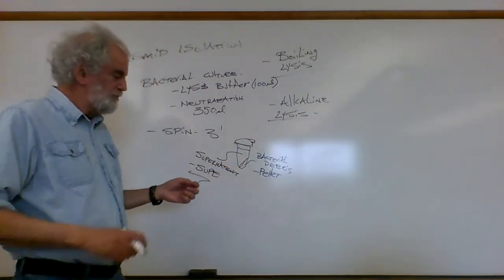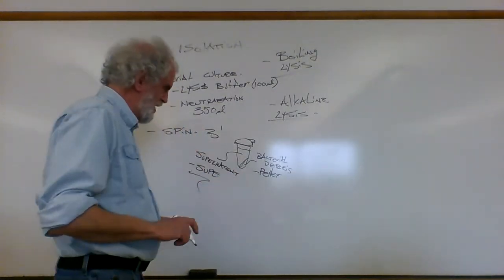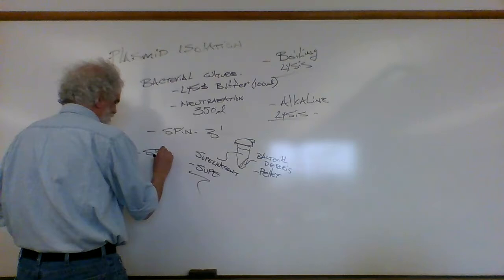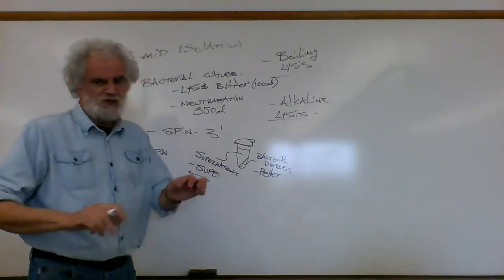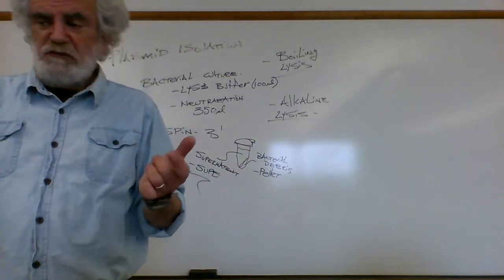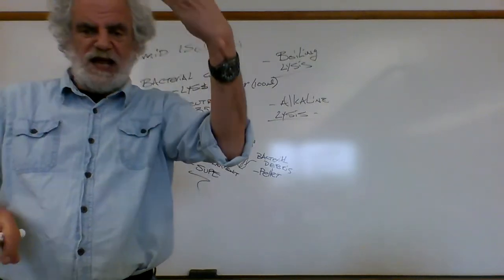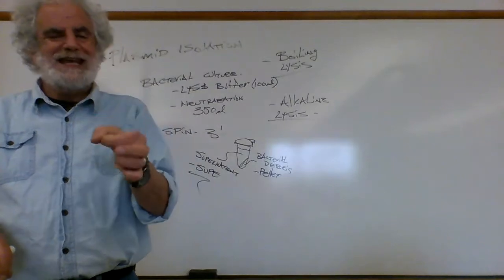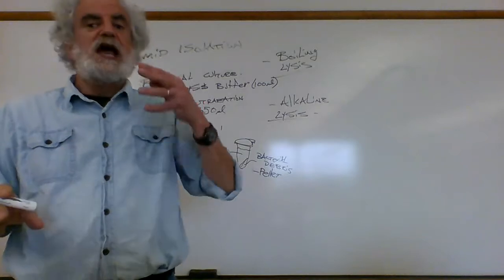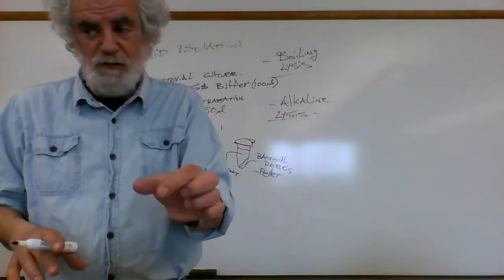We want the soup. So using a micropipette and being very careful not to disturb the pellet, you're going to take the supernatant and put it into a spin cup. That is one of these little column things. They call it the mini column, whatever. And you centrifuge that down for 15 seconds, and whoop, all of the fluid will go in. The DNA is captured on the membrane. The only critical thing I'd like for you to keep in mind is, at any point, where is your plasmid DNA? First it's in the soup, now it's on the membrane filter.